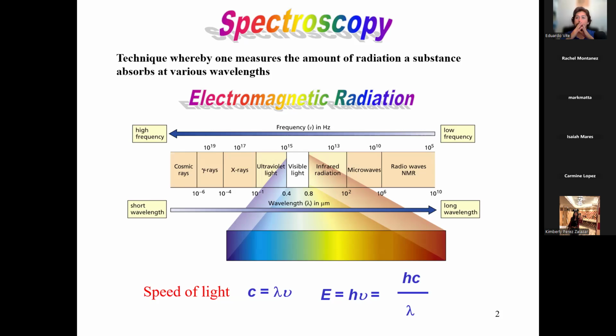Out of the entire range of the electromagnetic spectrum, we only see a small portion of it called visible light, right? Of course, it's visible. We see it. If you've ever seen a rainbow outside after it rains, all of those colors are visible light. So everything that we see, the trees, the sky, our vehicles, the roads, a nice colorful compound, everything that we detect is in the range of visible light. We have built-in spectrometers in our bodies. We call them eyeballs, right? So it's not the entirety of the electromagnetic spectrum. There's a lot more that we just don't see.